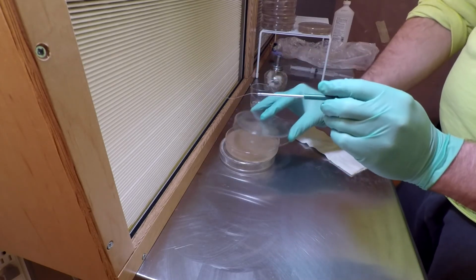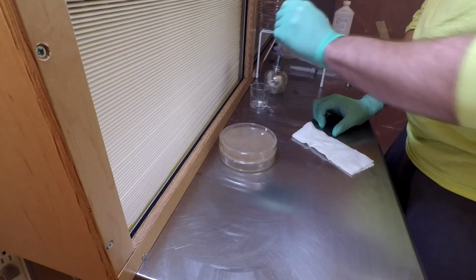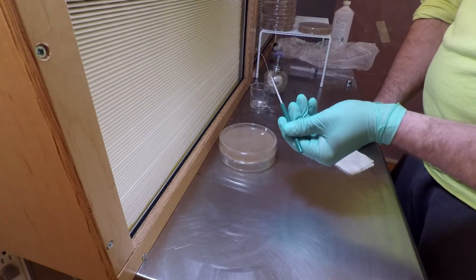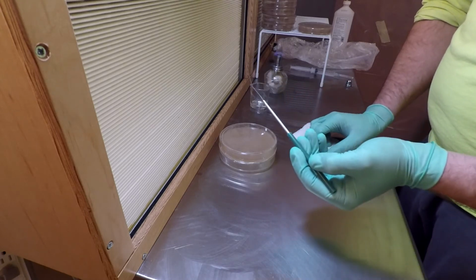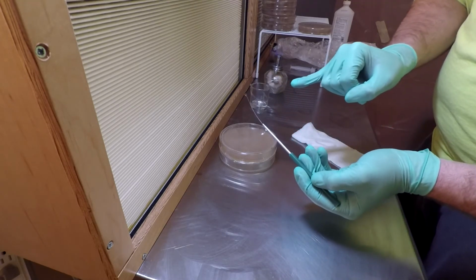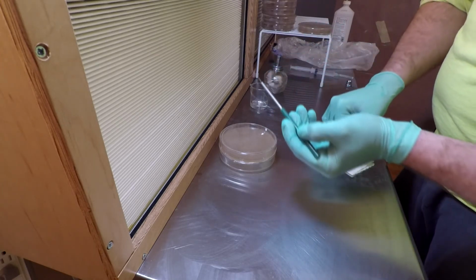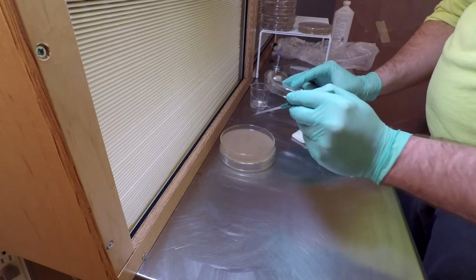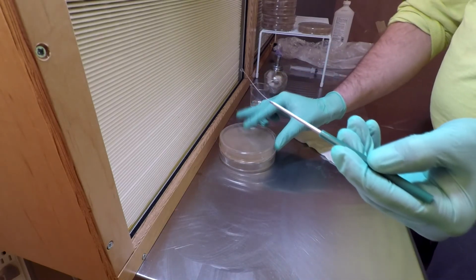Just some of the wetness off the top of that. And then I'm just going to touch it to the liquid. I don't want any excess liquid on there. See, like an oil dipstick of a car, I could see some water trapped in the loop. Go ahead and just knock it off. You just want the tiniest amount.